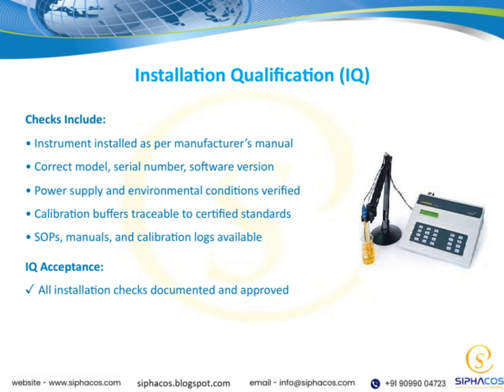We also verify the power supply and environmental conditions around the instrument. Proper power and suitable environmental factors, like temperature and humidity, are essential for accurate and reliable operation. Calibration buffers used during setup should be traceable to certified standards, ensuring their accuracy and integrity.